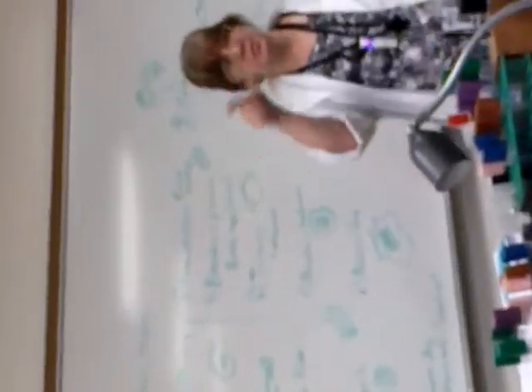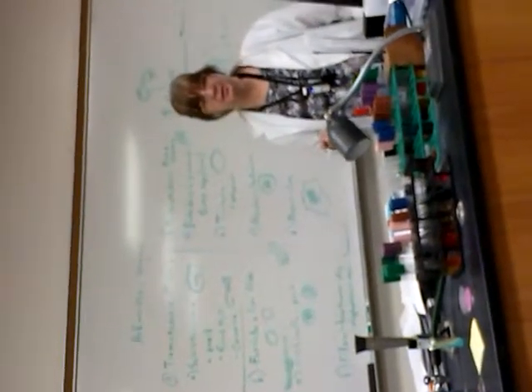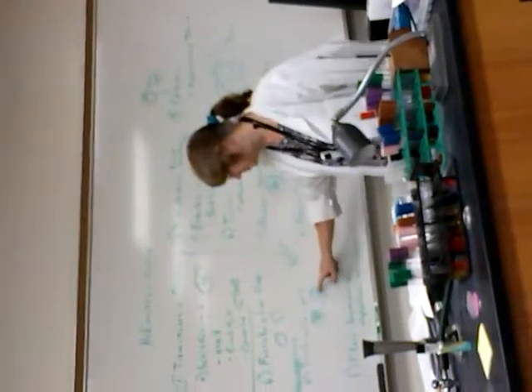Ascaris doesn't have a common name at this point in time. Its life cycle goes through your lung, and it can get pretty big. There are some samples back there in jars. It has a scalloped type of outer shell to the eggs, sometimes hard to see because they break apart. Trichinella. In what? Pork. Okay? Where will you find it in a person? Or in an egg? Slice what tissue? Muscle tissue. And you're going to find the worm either cut this way or on its side, coming out at you, in which case you will see holes coming out at you.